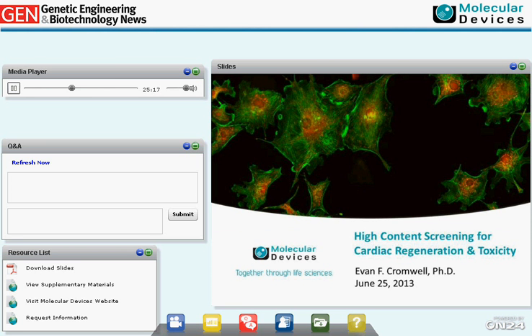So now I'm going to switch gears a little bit. It was an excellent presentation by Miguel talking about cardiac regeneration and how miRNAs can be used to induce cardiomyocyte proliferation. Here we're going to focus more on cardiac safety, or safety and toxicity, using cardiomyocyte models, specifically stem cell-derived models. I'd also like to acknowledge the scientists in my group at Molecular Devices who did this work: Oksana Sirenko, Jane Hesley, and Carol Crittenden.